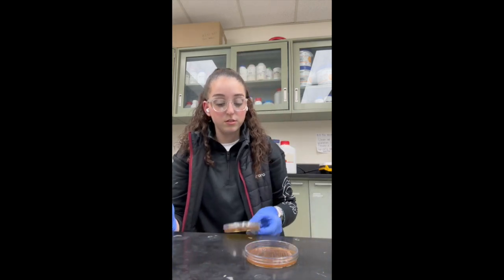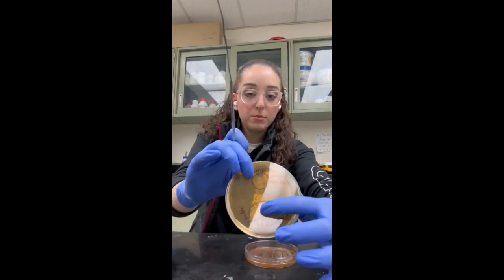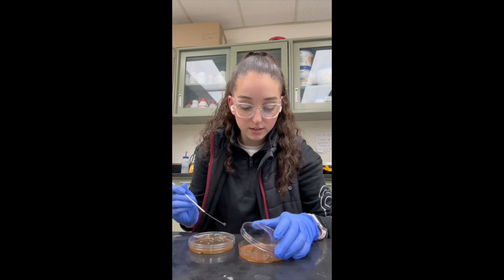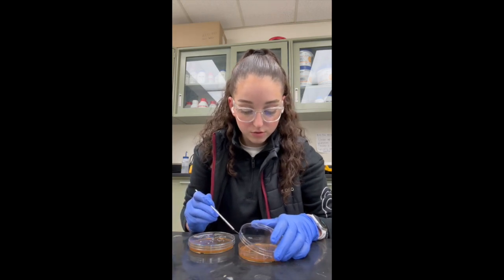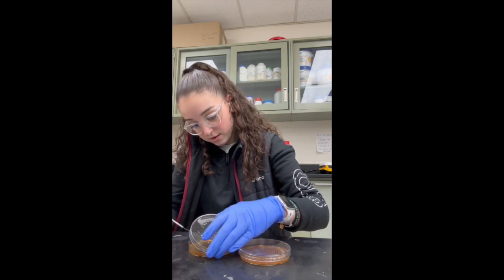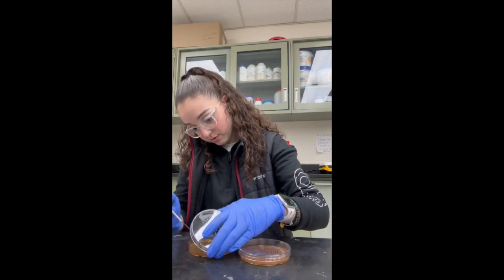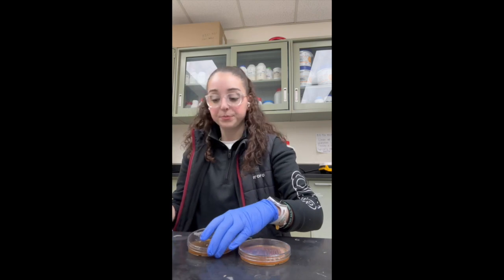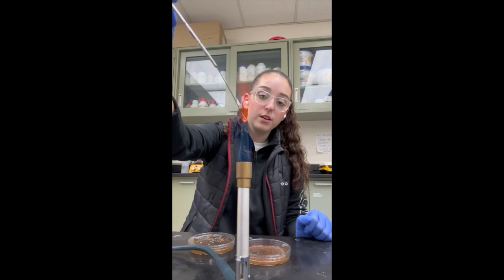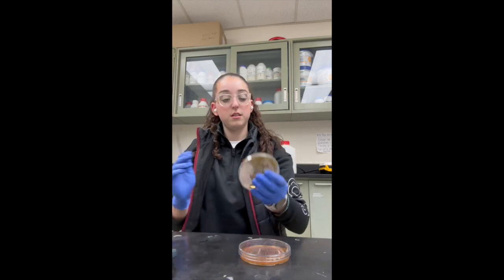So this one, you can already see they're streaked, and this one, and then this one. I'm going to streak this one first, and then I'll streak the sample last, so I don't contaminate my control. So doing that control first here, and now we're doing the sample, mixing those two. Then we'll flame the loop again to sterilize it for next use, and then we'll incubate our sample.